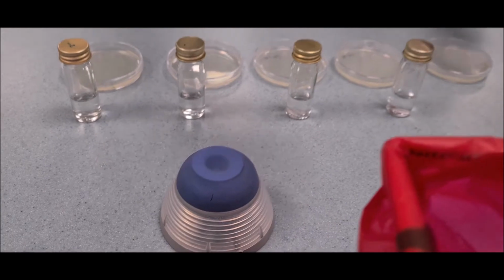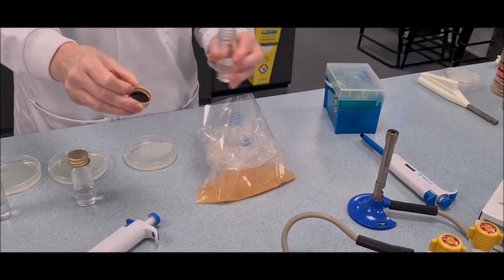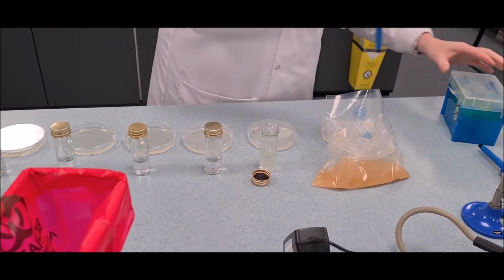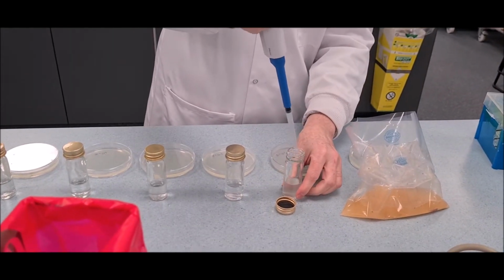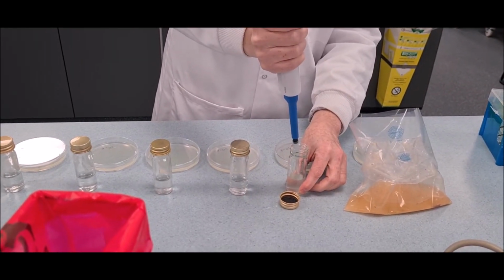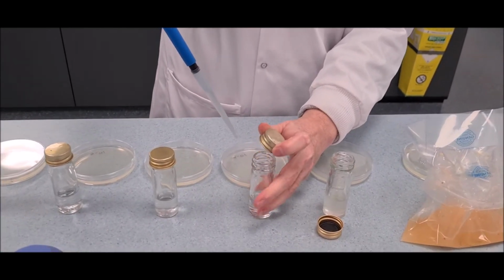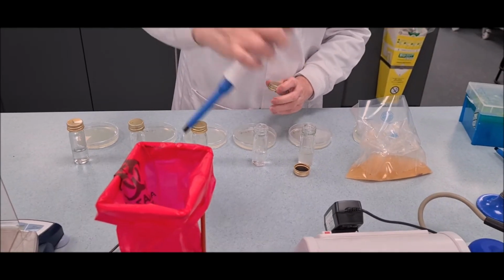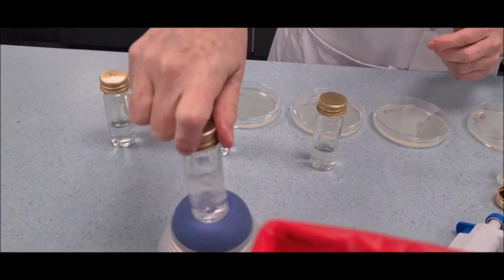Next, open the cap and flame the neck of the bottle. Aseptically pipette 1 milliliter or 1000 microliter of culture from the first dilution bottle into the second dilution bottle, using a fresh pipette tip. This gives us a dilution level of 10 to the power minus 3. Replace the cap of the second dilution bottle and mix very well using the vortex mixer.